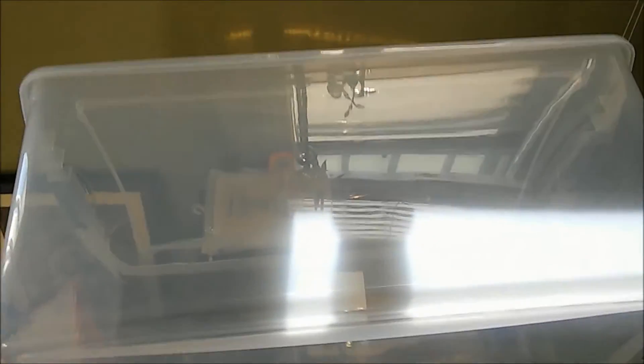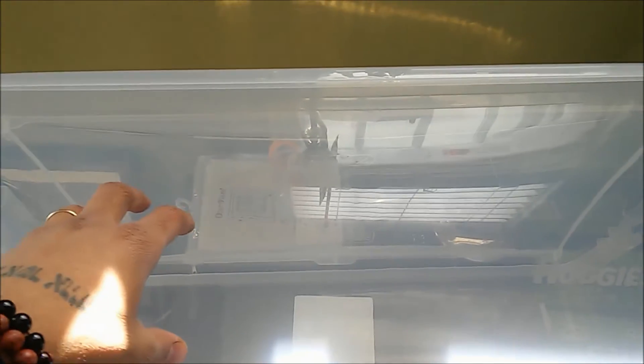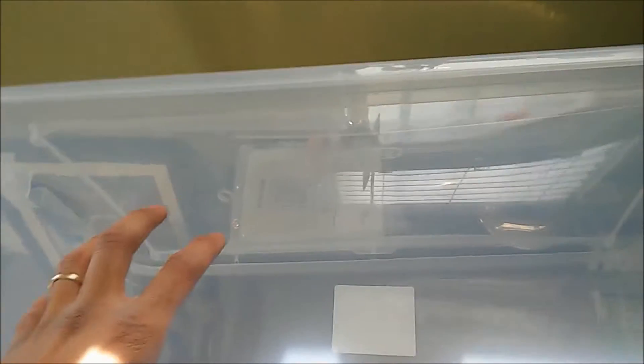So what we're doing right now is the first step. We're going to put some armholes in here. You're going to want to make sure that the armhole for your dominant hand is higher than the armhole for your non-dominant hand, so that you can get your arms around the whole area of the glove box.